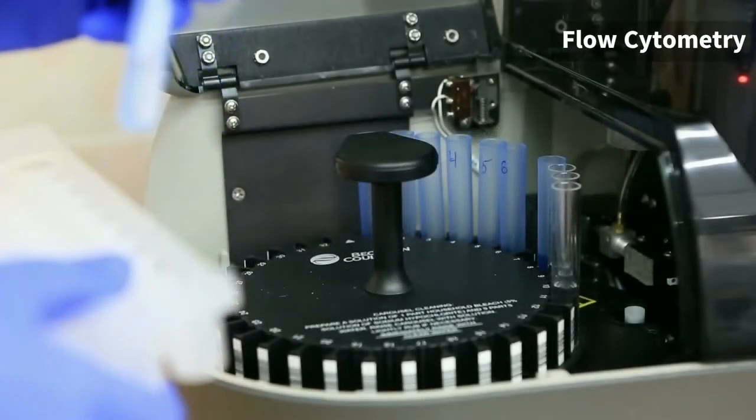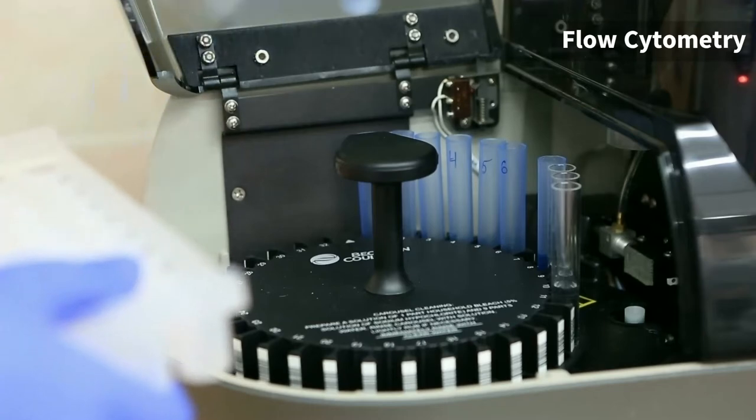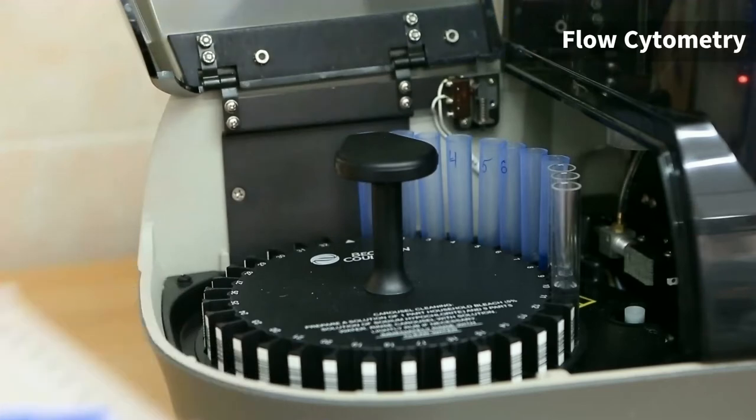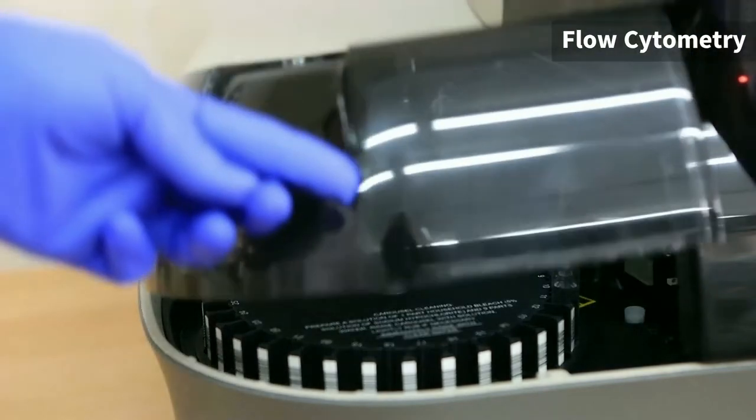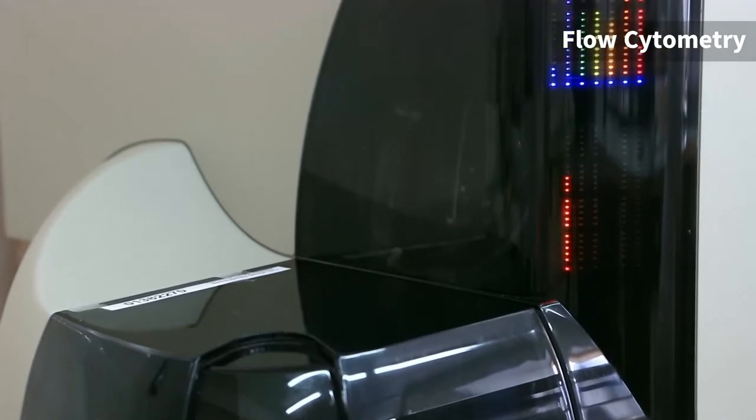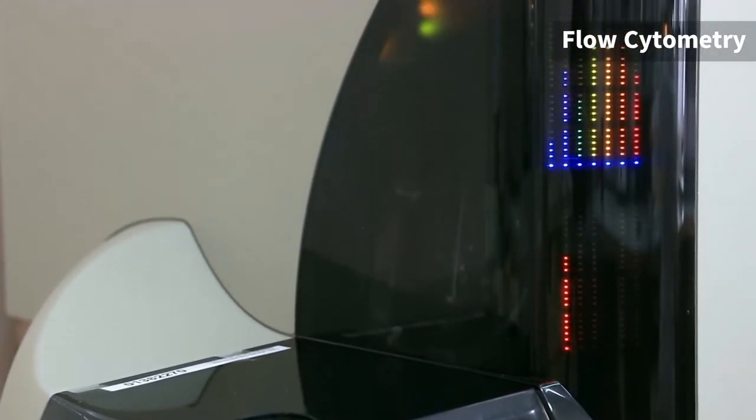Flow cytometry is used to examine the physical and chemical properties of cells and microparticles. Cells are typically suspended in a fluidic stream, passing by a detector to reveal cellular information such as size, shape, and other detailed characteristics. Specialized cytometers can sort or even image the cells for further analysis.